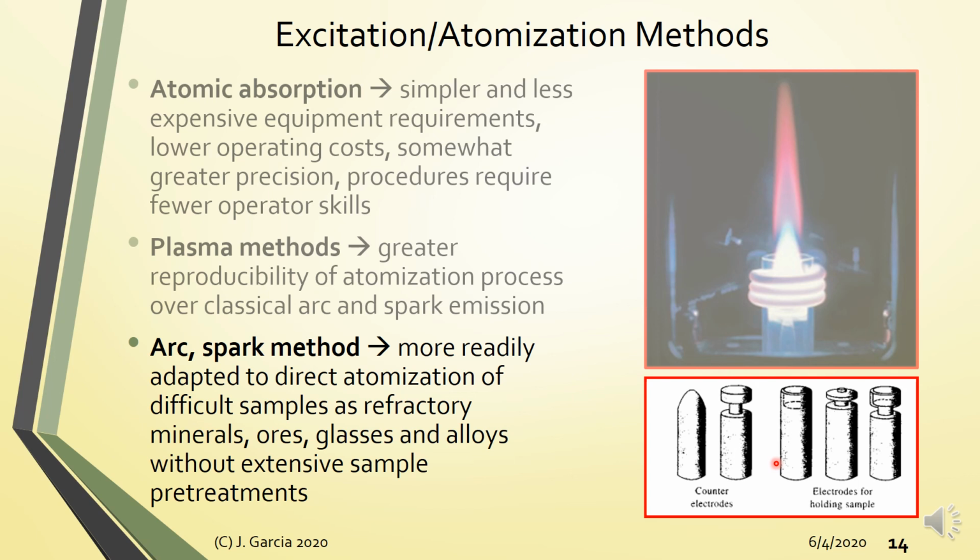Okay, so you have here the different atomization methods for emission.